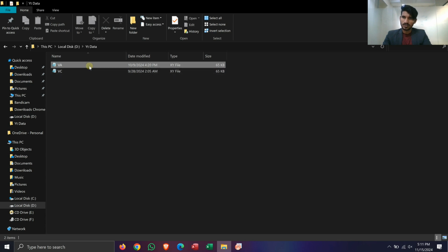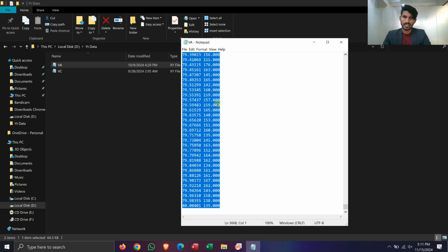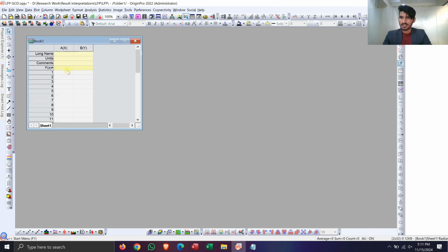First of all, I'm going to open the VA. I'm going to press Control A, Control C. I have copied all the data, and here I have to make a new workbook. In that place, now I have to paste this XRD data.